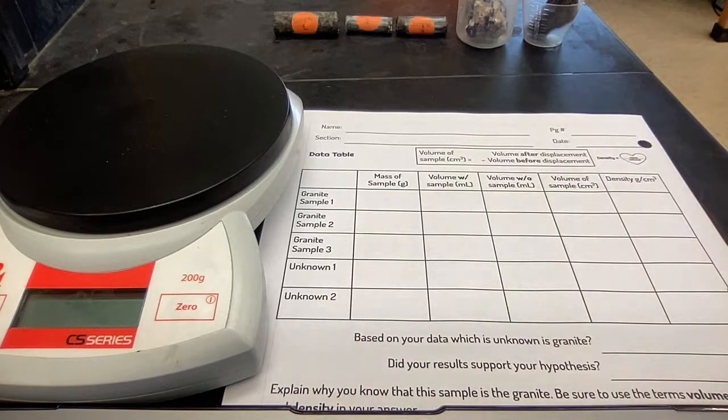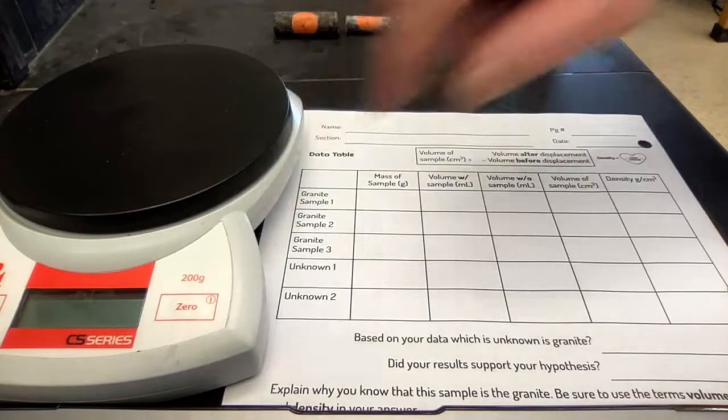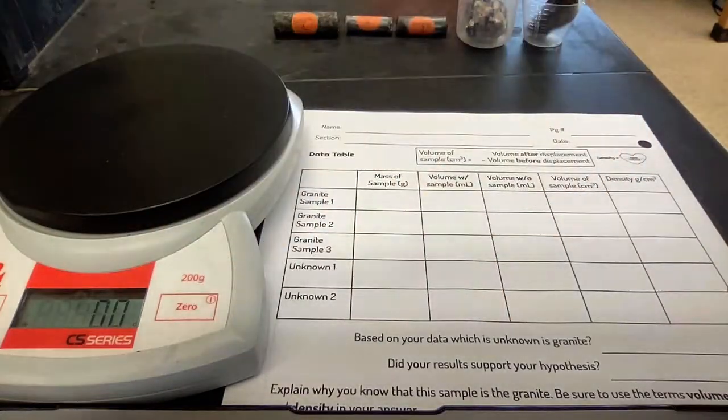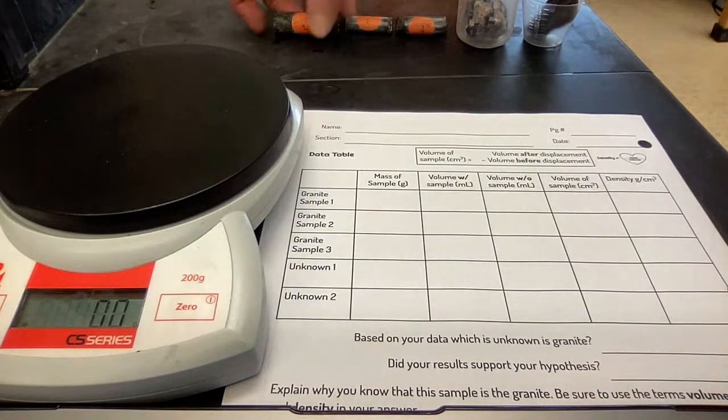Hi, in this video, we're going to try to determine the density of 5 different samples of rock, 3 samples of granite, and 2 unknown rocks to determine if one of the unknowns might be granite. So we're going to start with sample 1.